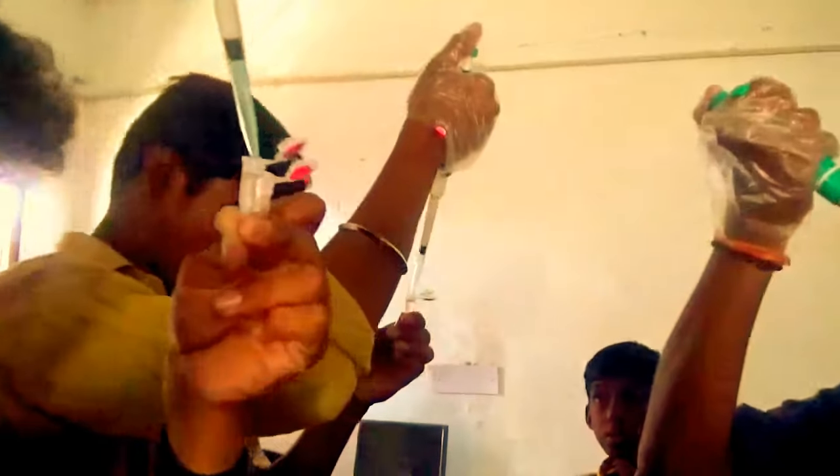Try slowly, slowly. Just stop here. Your liquid is very less. Try a small amount and then shift it.